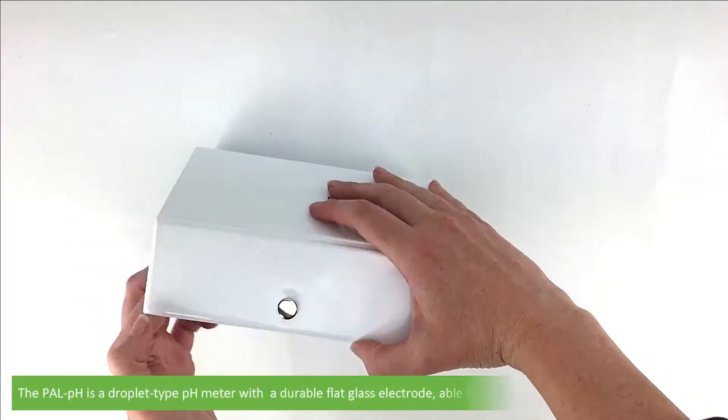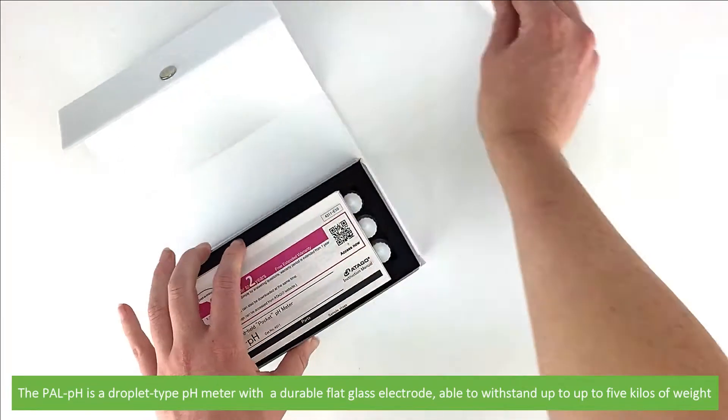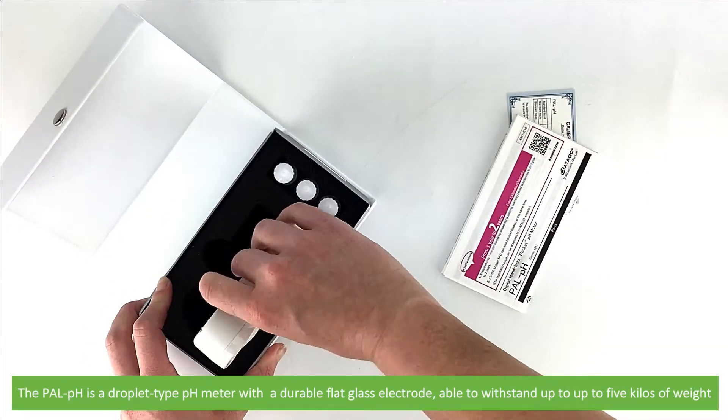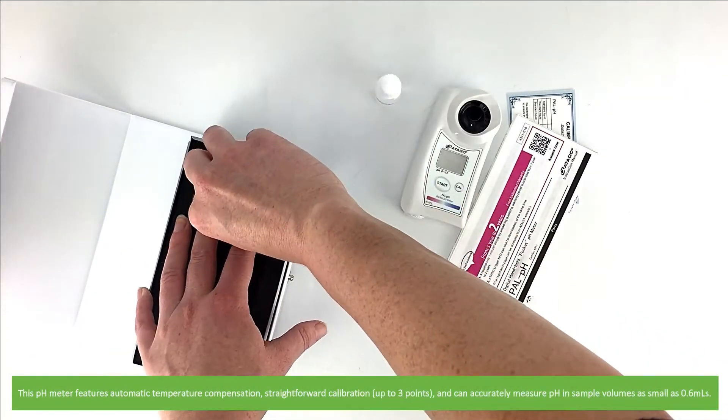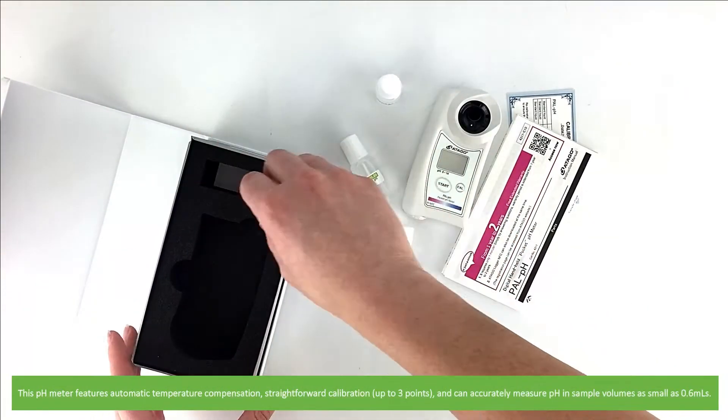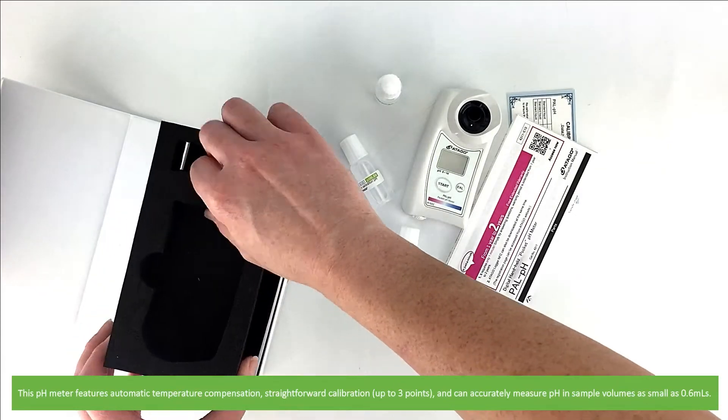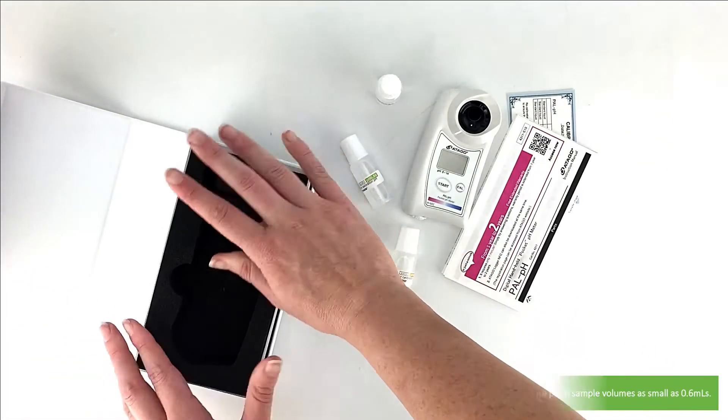The PAL PH is a droplet type pH meter with a durable flat glass electrode able to withstand up to five kilos of weight. This pH meter features automatic temperature compensation, straightforward calibration up to three points, and it can accurately measure pH in sample volumes as small as 0.6 mils.